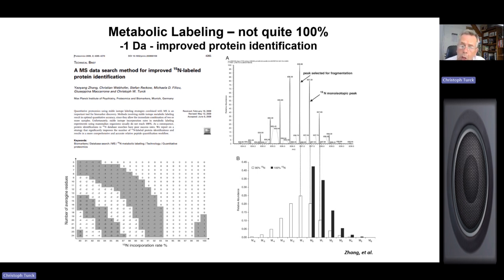Why is that? Well, in the diet, of course, there is not only protein, which might be almost 100% labeled. You also have other compounds like vitamins and other small molecules that have nitrogen, which were not labeled. So as a consequence, and that's shown here on the right, if you look at the mass spectra, if you know something about tandem mass spectrometry with data-dependent acquisition, what happened then, and still happens today, is that the most intense isotopologue pattern is taken for fragmentation.